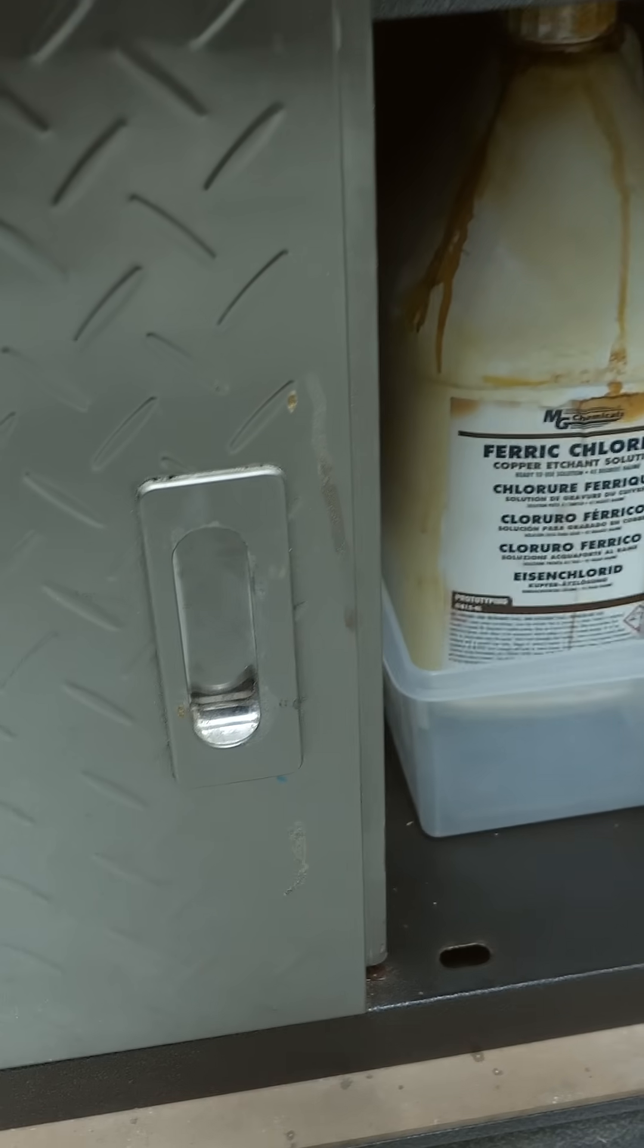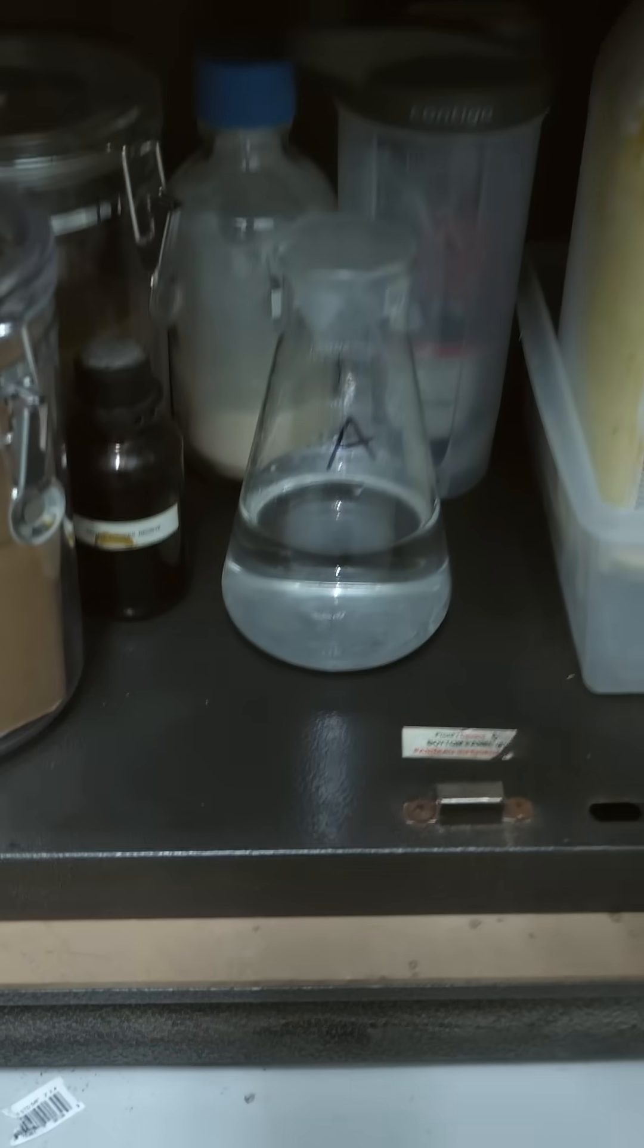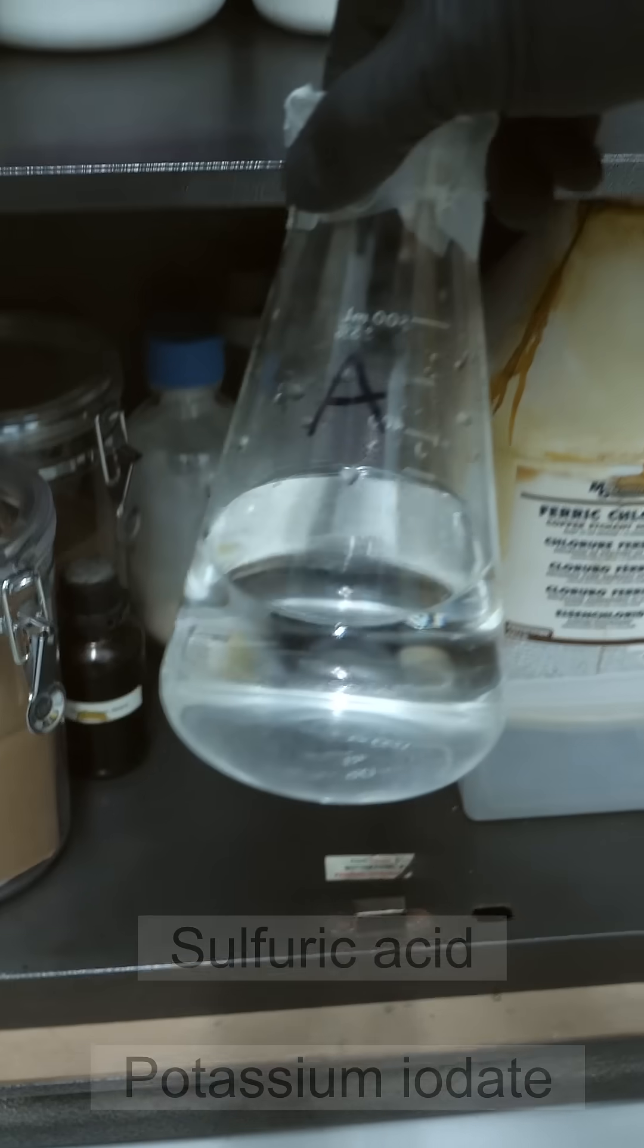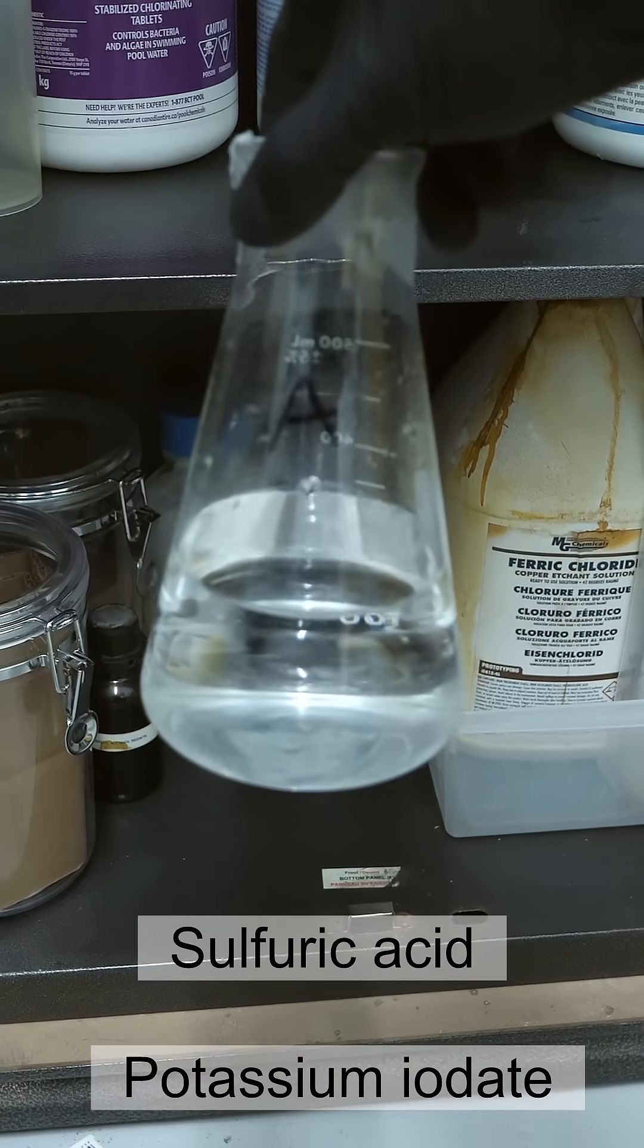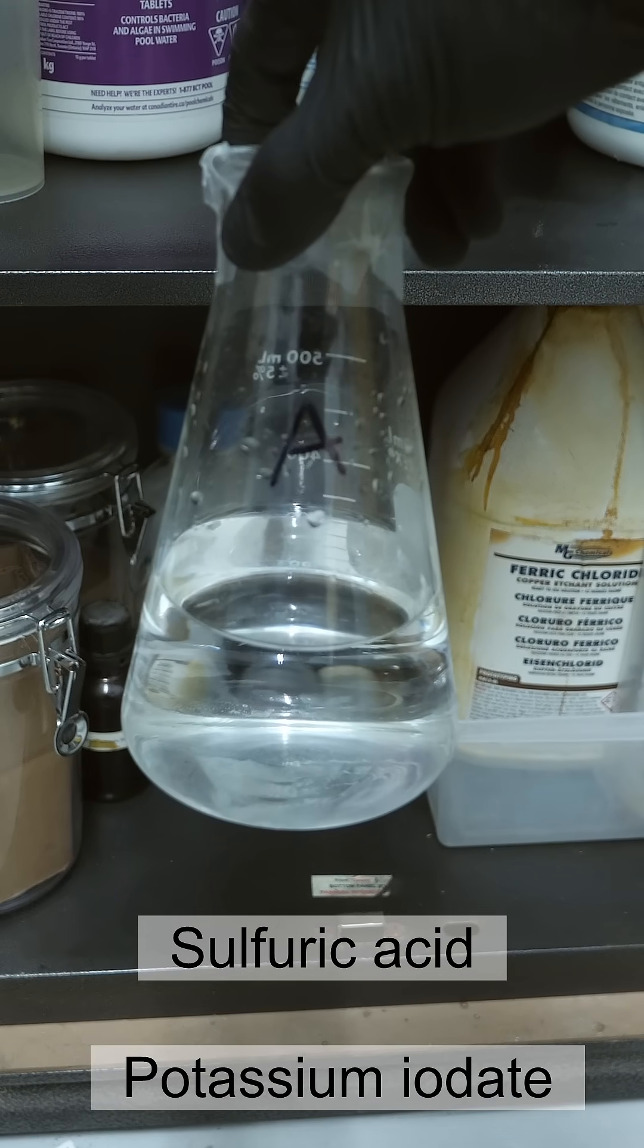Today, I've decided to do something which I think kind of looks like magic. To get started, the first thing I'll need is solution A, which contains sulfuric acid and potassium iodate.